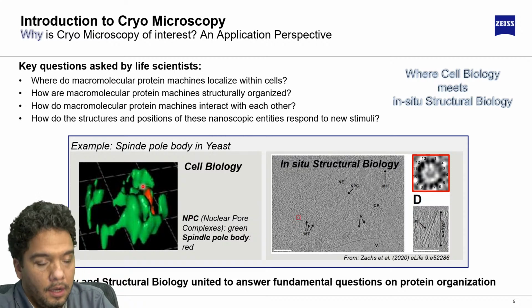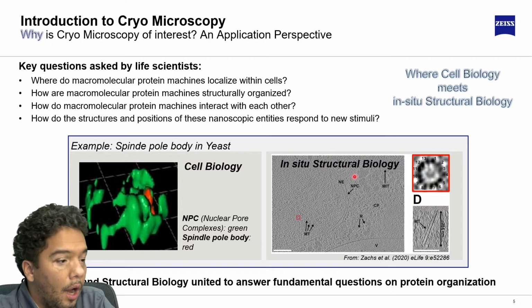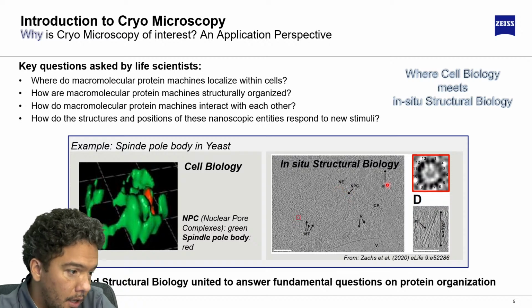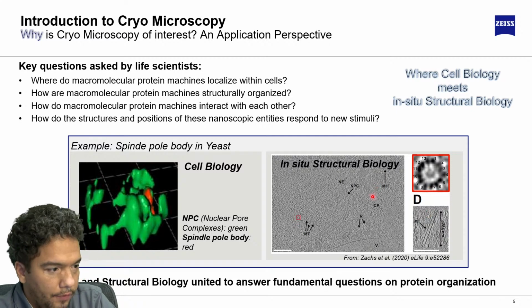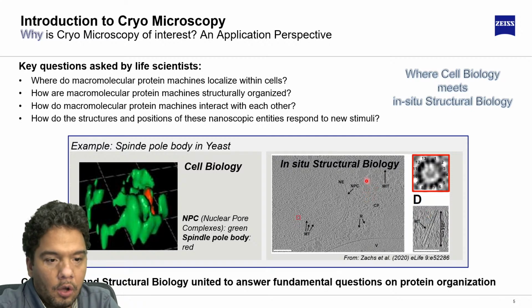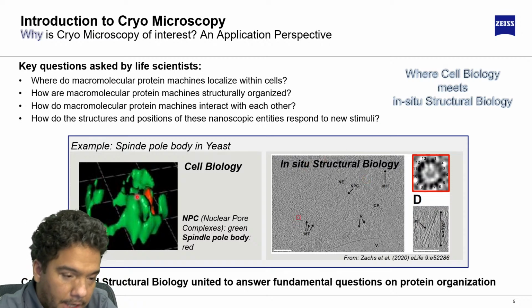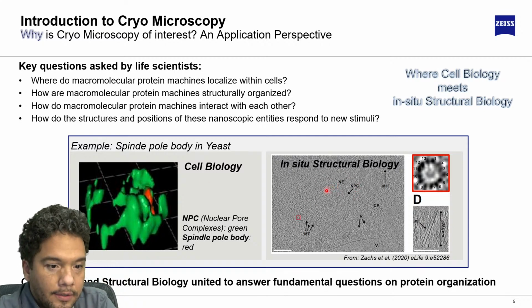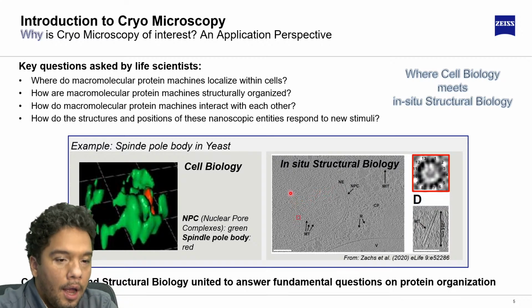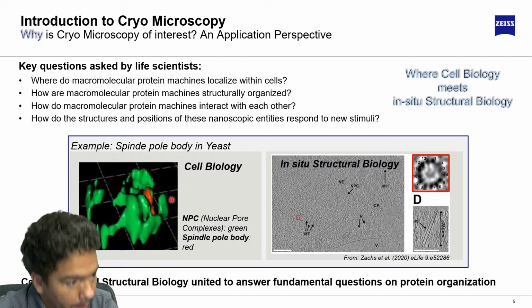And what is the final result, the 3D structure that we are getting? Imagine that we are collecting 2D images with these techniques, but we are collecting serial section imaging that allows us to create this kind of information, or electron tomography, when we create a very thin section of the sample, and with tilting imaging we can collect and create electron tomograms.